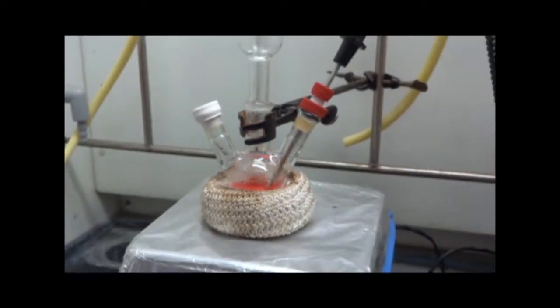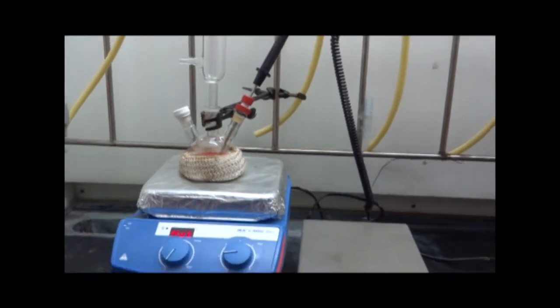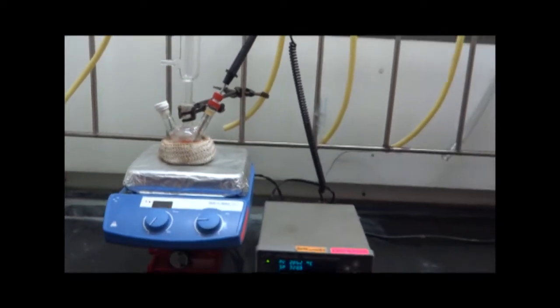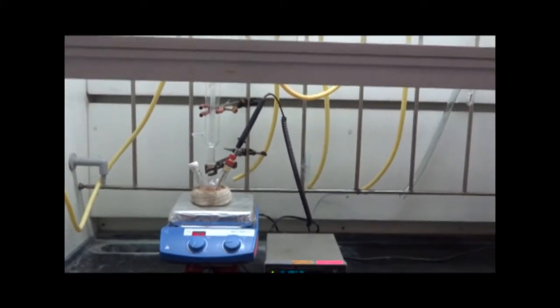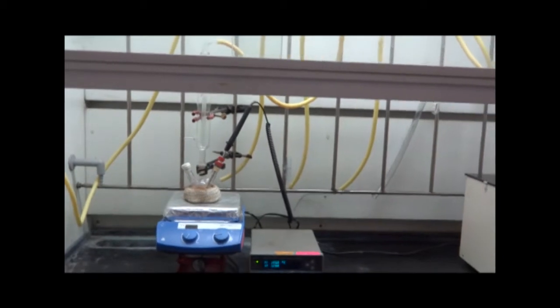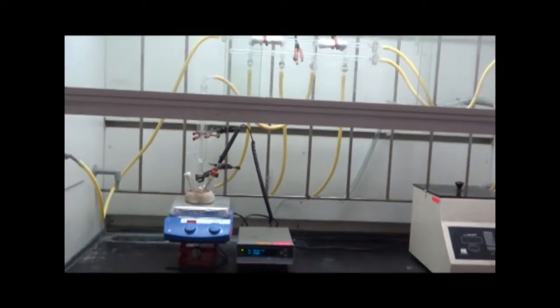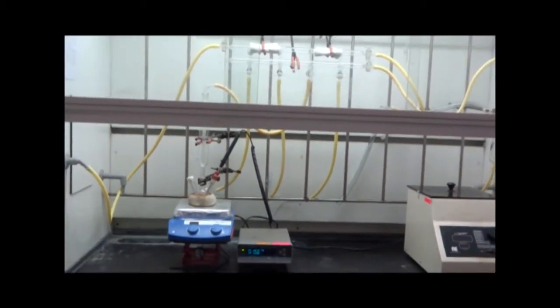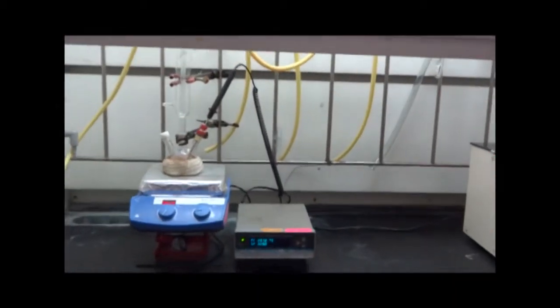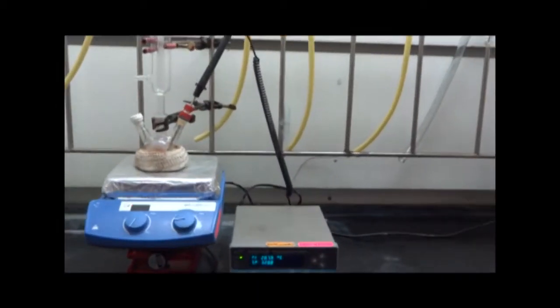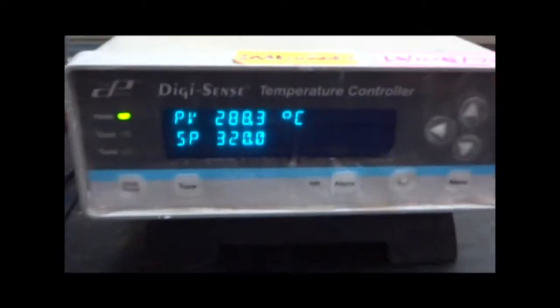We can see the solution change in color. This happens due to the quantum confinement effect. As the reaction proceeds, the size of the nanocrystal grows. Hence, we see a red shift in the emission peak. So the color changes are a good sign.